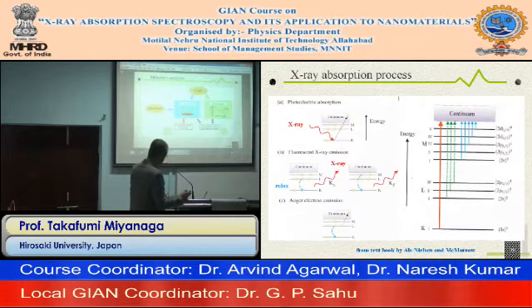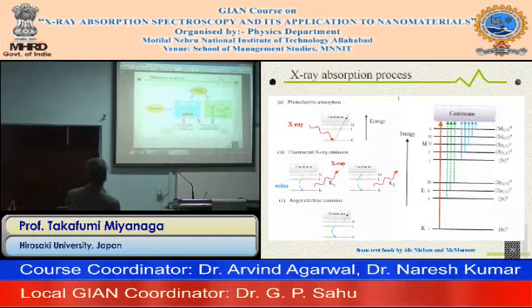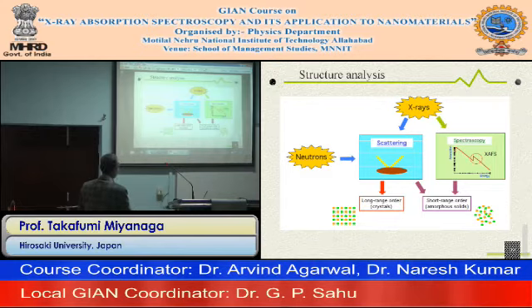Finally, we summarize the process of structure analysis using X-rays and compare it to neutrons.